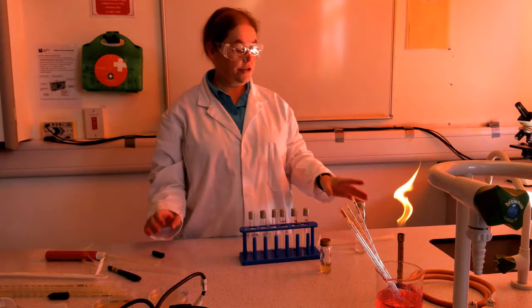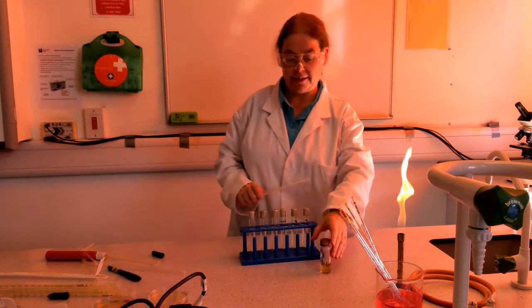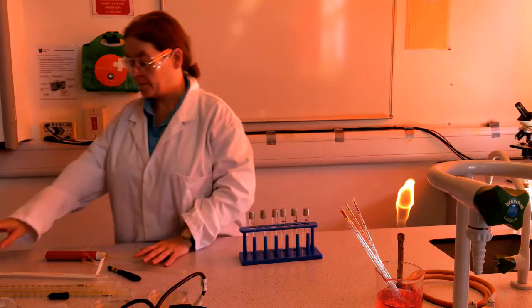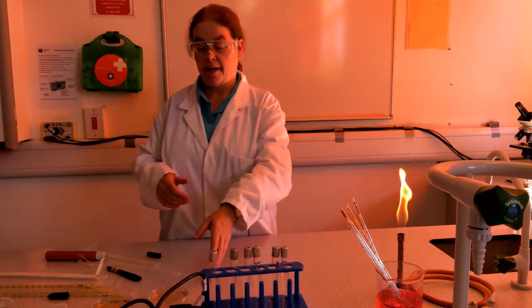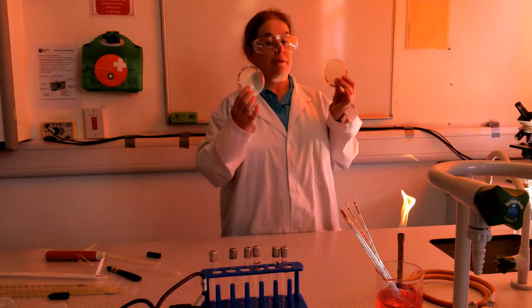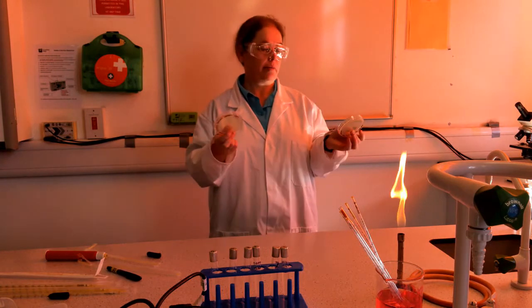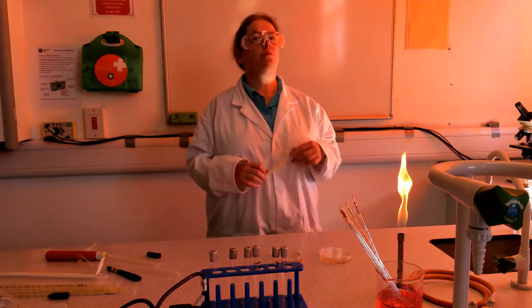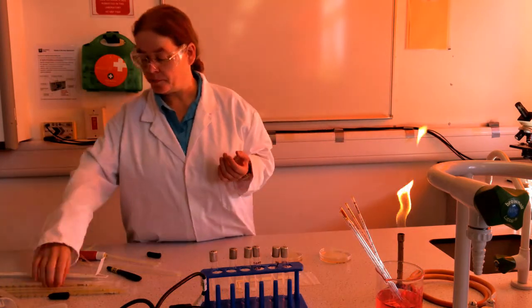So what we need to do now is clear away some of these things that I need no longer. Bear with me a mo. Okay, what I need to do now is take my 10,000 and 1,000,000 dilutions and plate 0.1 millilitres of them out onto an agar plate and spread it using the same method that we learned when we were learning about correct sterile technique a couple of weeks ago.